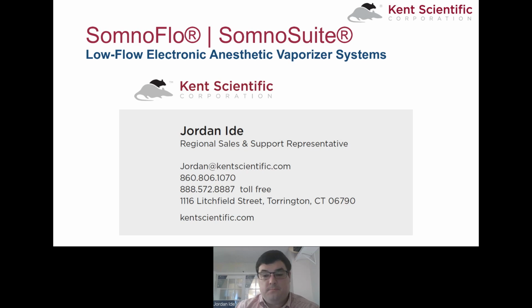If we're not using any radioactive material, how would you clean the Somno Suite? Sure. The Somno Suite, the outside can be cleaned with standard lab cleaner, and the system's internals can be cleaned with any standard lab vaporized disinfectant, such as vaporized hydrogen peroxide. You just attach it up to the air ports. Do not autoclave them, please. Thank you for specifying that, because I'm sure that's the usual go-to, perhaps.